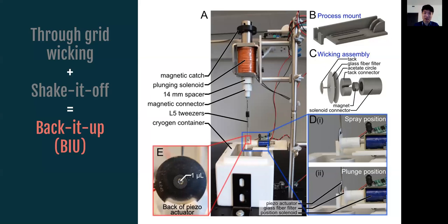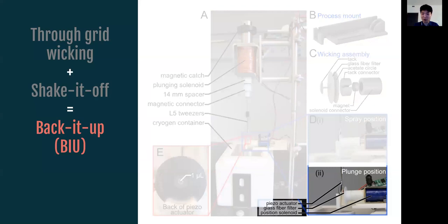So what we wanted to do now is combine this through-grid wicking technology together with the Shake It Off device to make a new device called Back It Up, because now the filter paper is coming from the back of the grid, and then you're spraying your sample in the front of it. So this is pretty much similar to what I had before, so I'd like to focus your attention on the arrangement of the grid as well as the filter paper. So now we have the filter paper that has been reintroduced, and that is placed behind the grid, while the sample is actually applied from the front using this piezo.